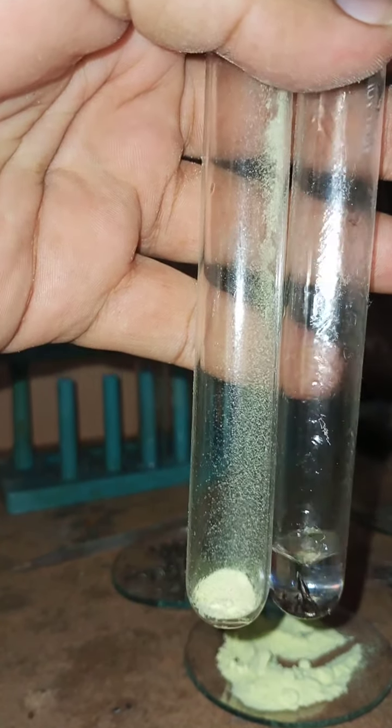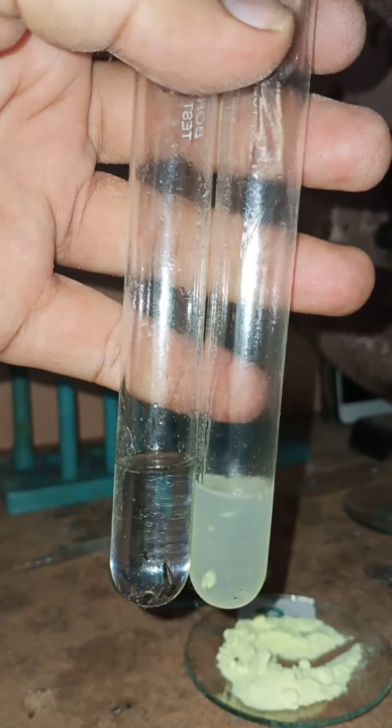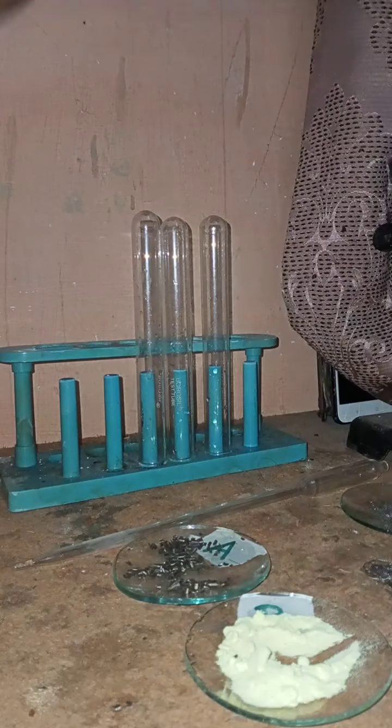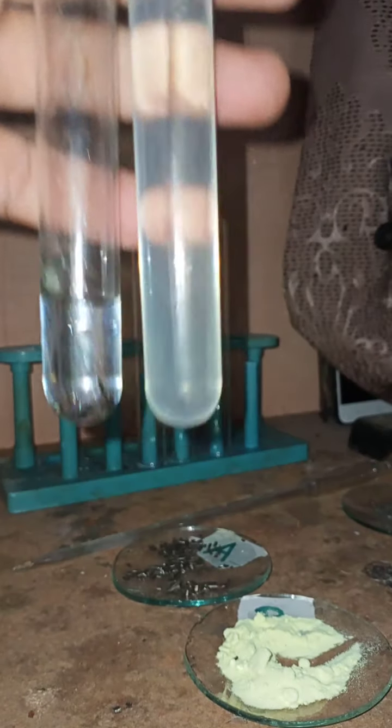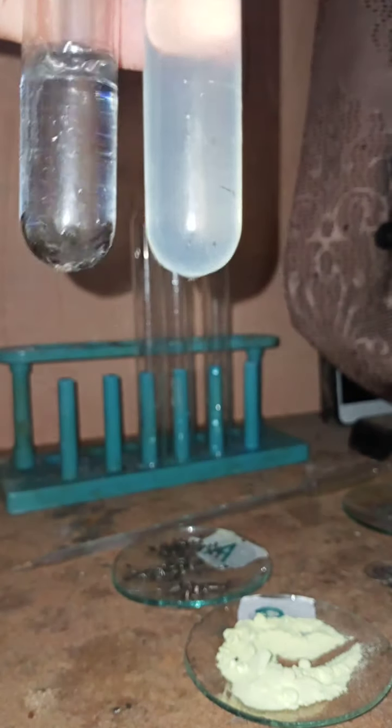First I have added carbon disulfide to the test tube containing the iron fillings, and now I am going to add the carbon disulfide to the test tube containing sulfur powder. And you can easily see that in the test tube that contains the sulfur powder, all the sulfur powder has been dissolved into the carbon disulfide, whereas these iron fillings cannot be dissolved and they remain the same.